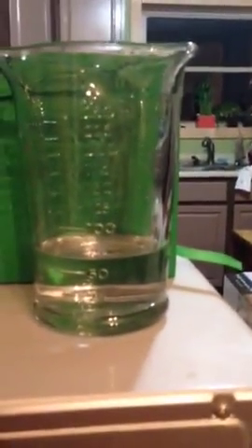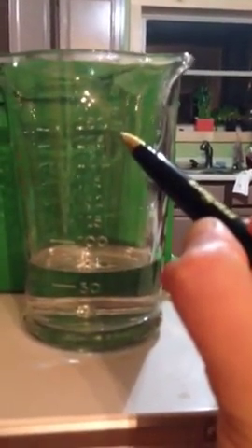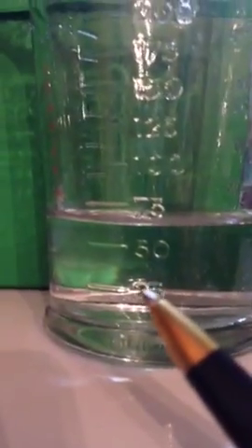Here is a container that looks like it holds 250 milliliters. It's okay if you can't quite read the numbers here. It holds 250 milliliters. And in order to get a good reading of our volume, we have to come down to eye level with the sample, meaning you can't see that circle. You see one flat plane, and that's really important. And then we go based on the meniscus, which is the lowest line.